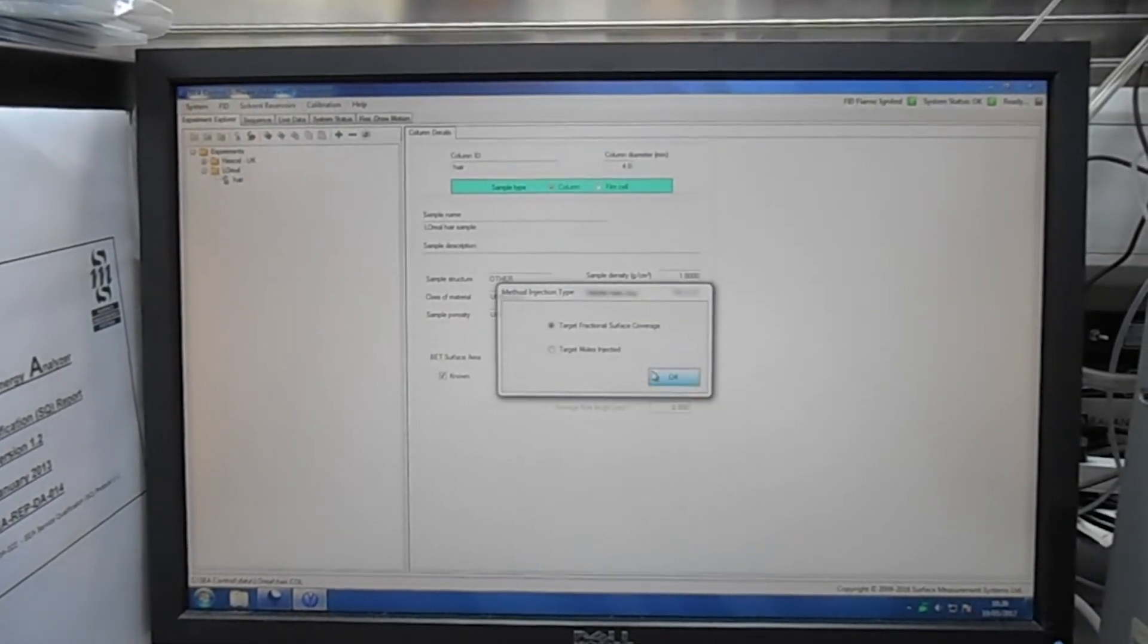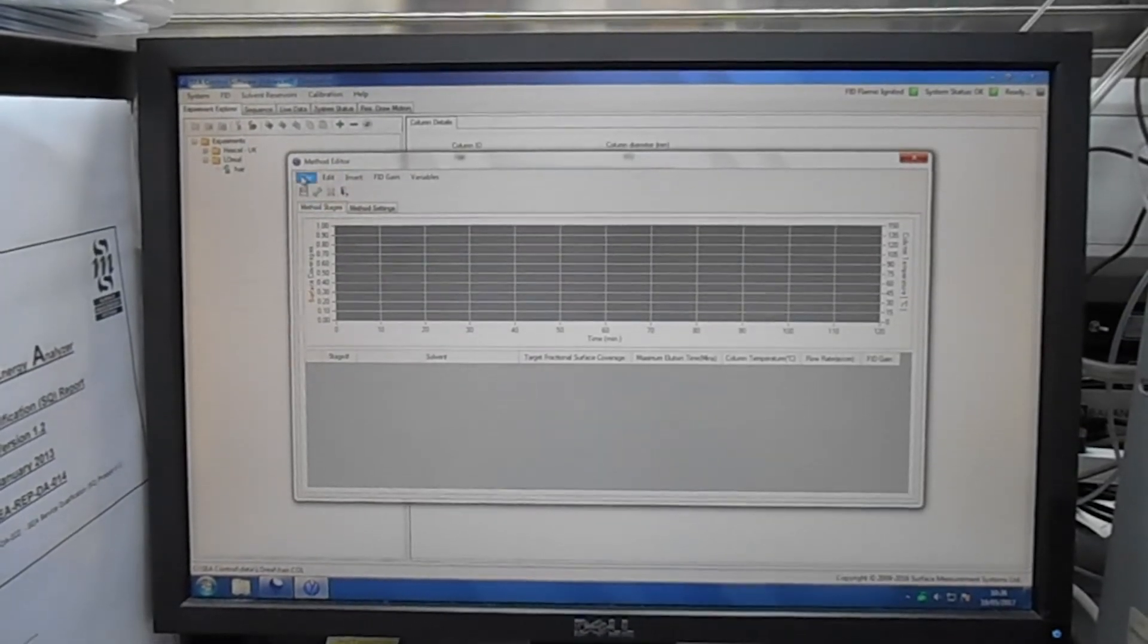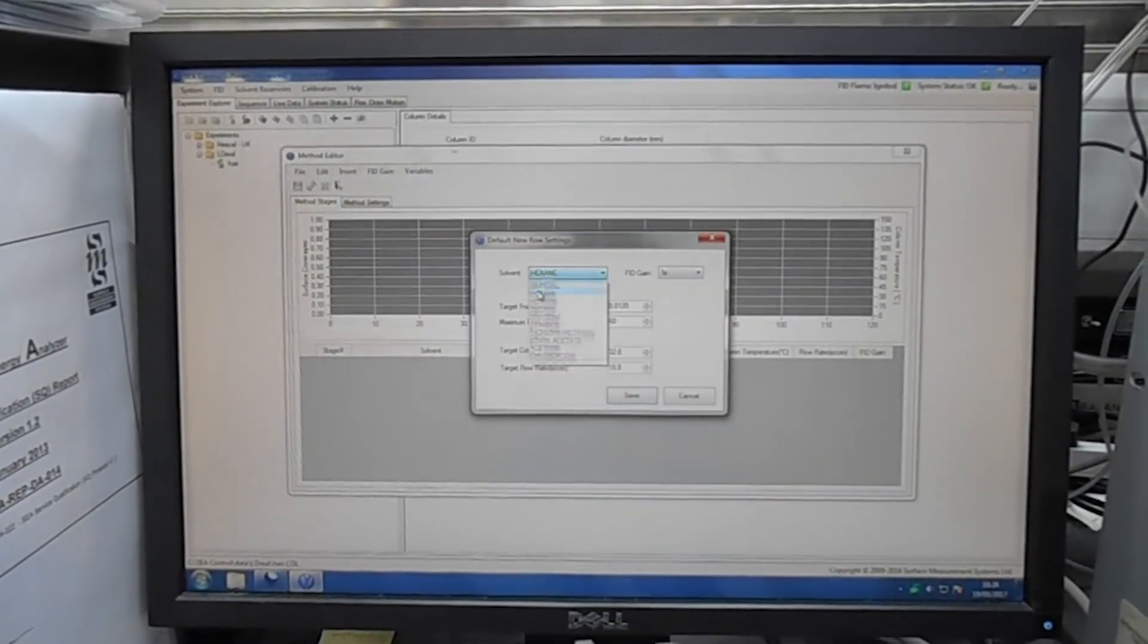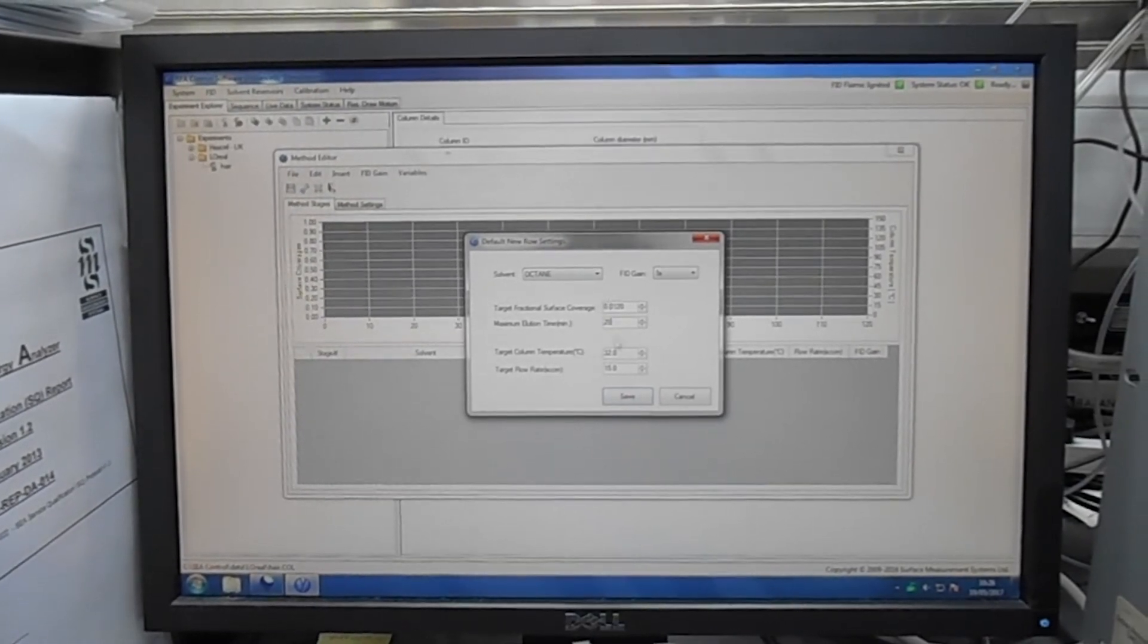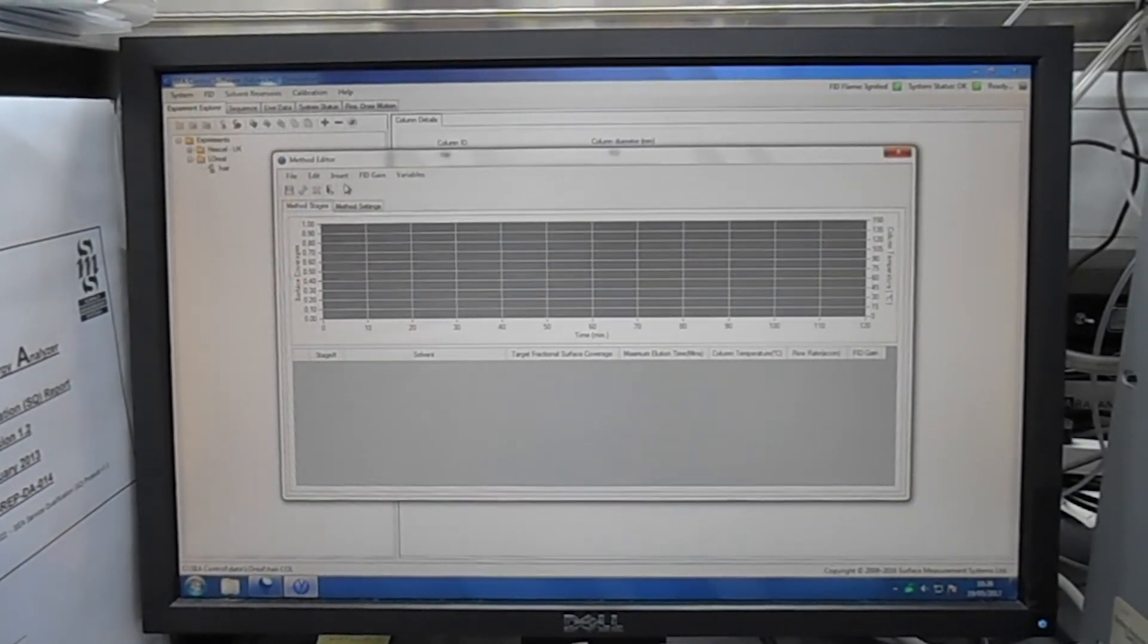What I am going to do now is show you how to generate a simple method for measuring BET surface area. The BET surface area characterization is usually carried out using octane as main solvent.